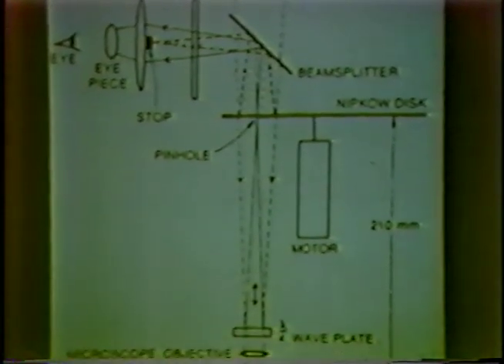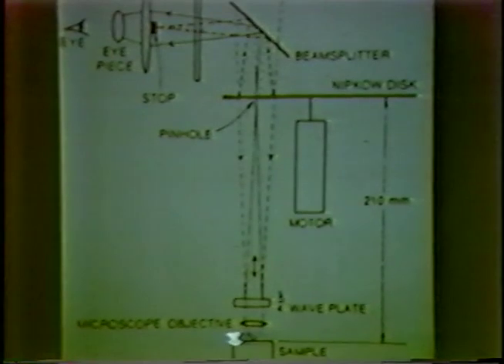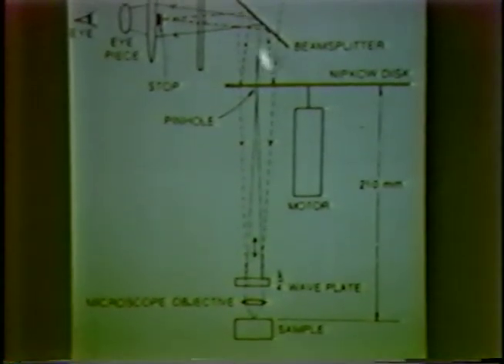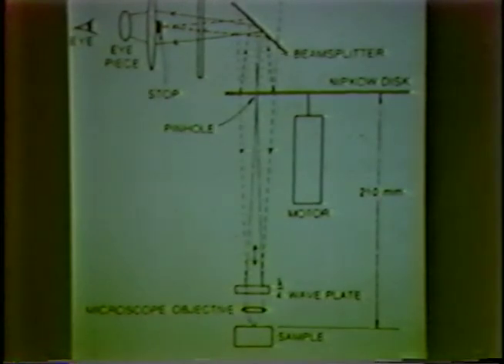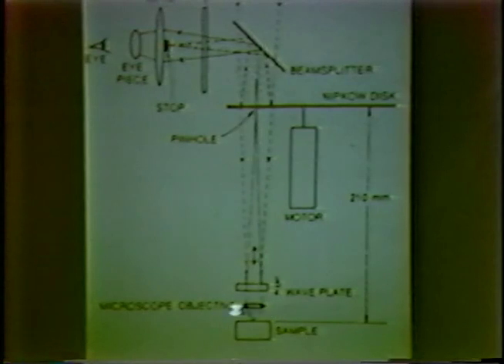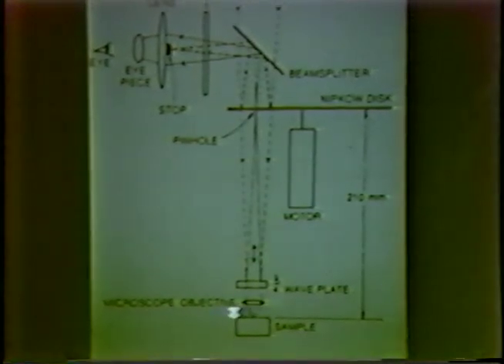But never mind, in fact, the level of reflections which you get from biological samples are so low that this system of discrimination is not useful in the biological world. But it is if you look at a very high intensity reflector, like a piece of silicon.